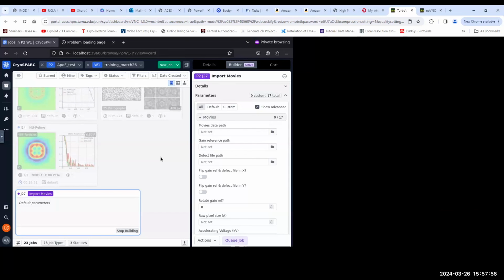Yeah, so what you need to do is what we call particle subtraction. So you process the small data set, and you make 2 masks. One mask is masking the density you want to keep, and the rest you want to discard, right?